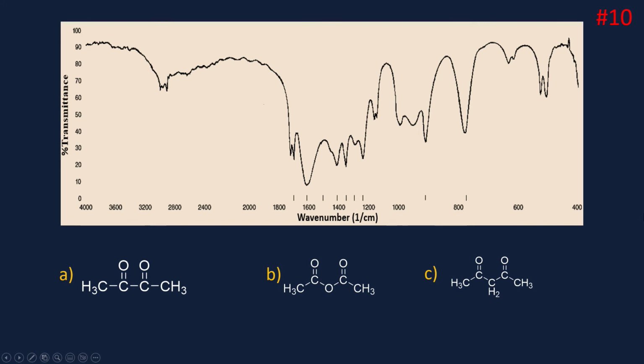To the last question. Well, it's quite strange in the carbonyl region with this mess and a small OH band that looks weird. What the heck is this? The only way this is explained is through the presence of tautomerization between keto-enol forms.